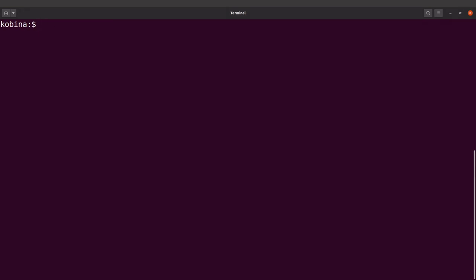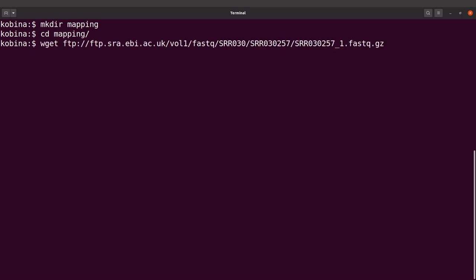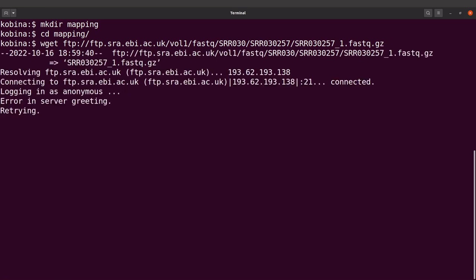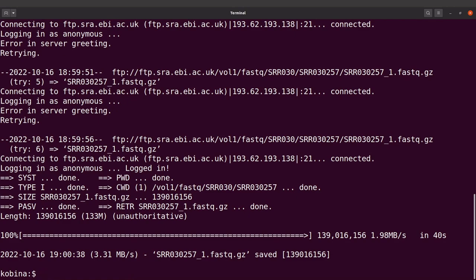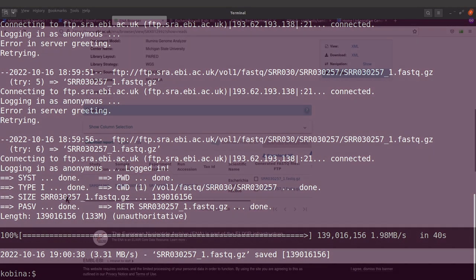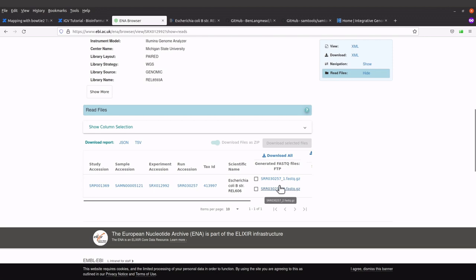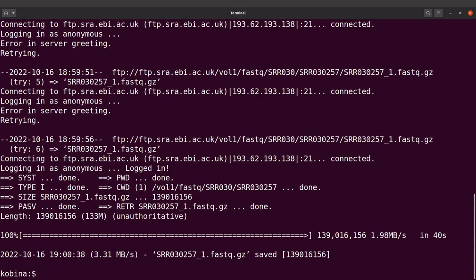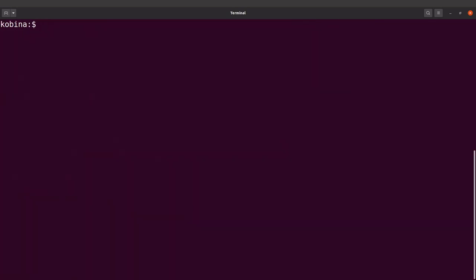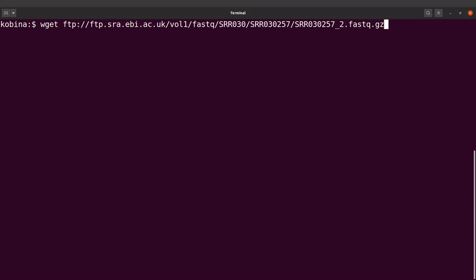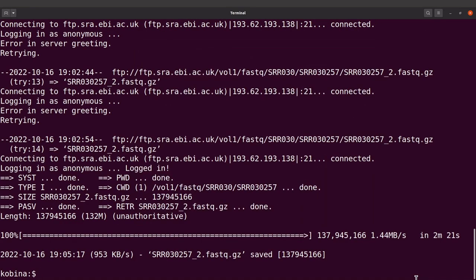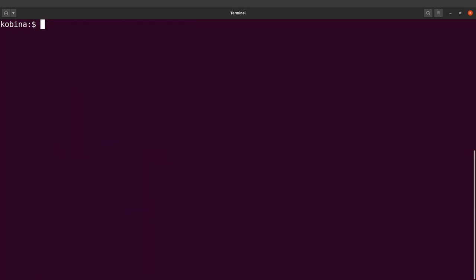On the terminal, I'll create a directory called 'mapping' and cd into it. Then I'll download the data using wget and supply it with the download link for read one. Read one has been downloaded. Now let's download read two — right-click to copy the link, go back to the terminal, use wget again with the download link. Read two has also been downloaded. Let's do an ls to check the files.